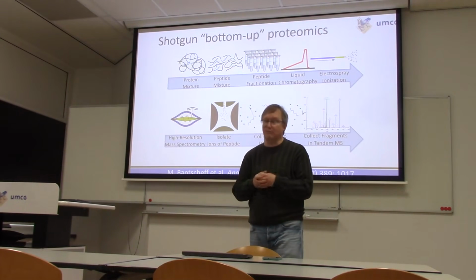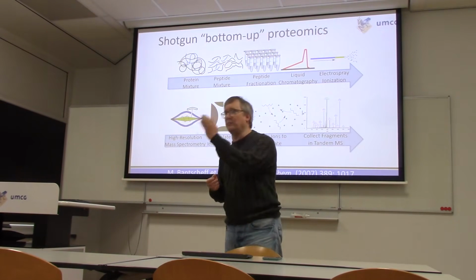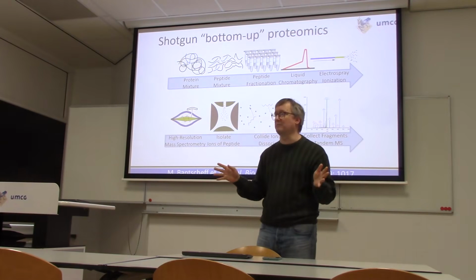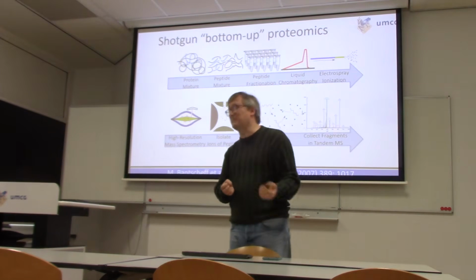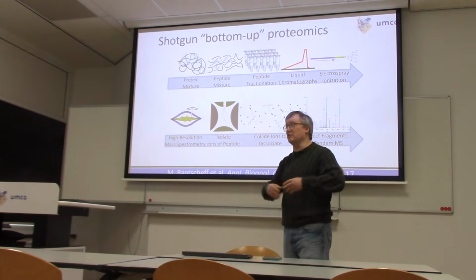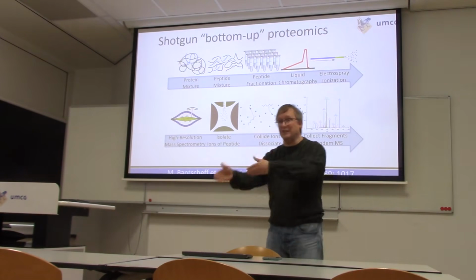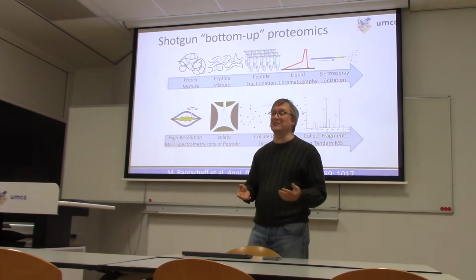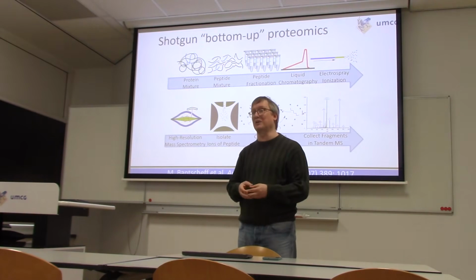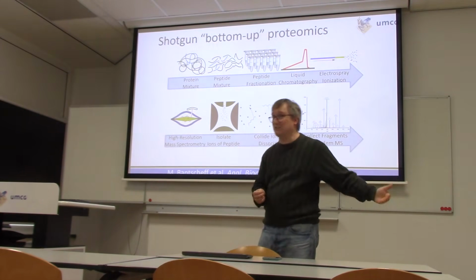Tandem mass specs are frequently in the neighborhood of $1 million once you throw in all the pumps and column equipment that comes with them. So naturally, the first priority for any lab operating a mass spec is to keep it busy. There's often far more samples that want instrument time than the instrument can handle at any given moment. So one of the most essential questions you should ask when submitting samples to a proteomics core is how soon this can actually go on the instrument.